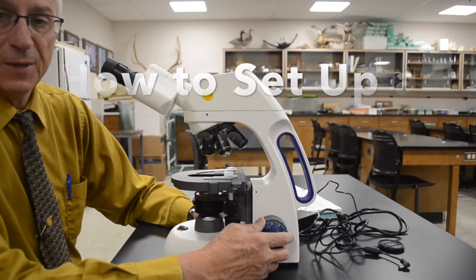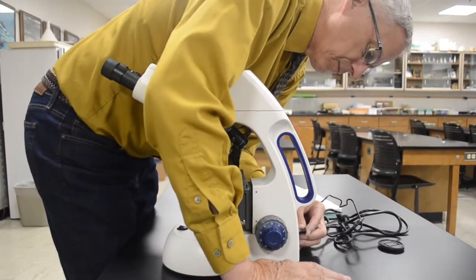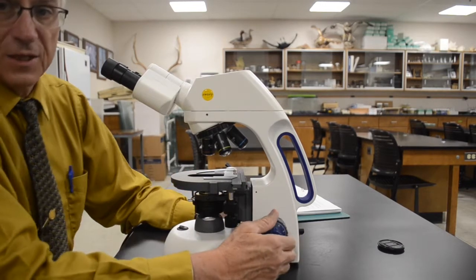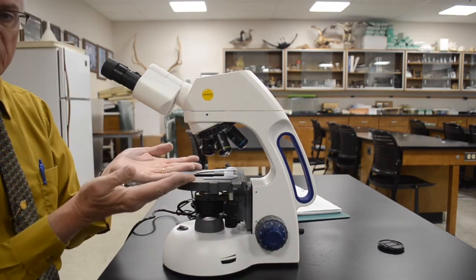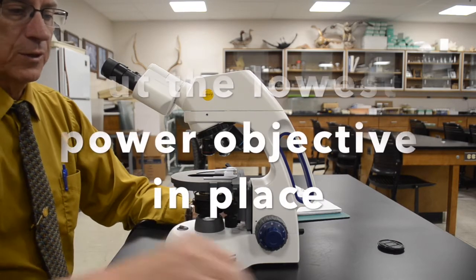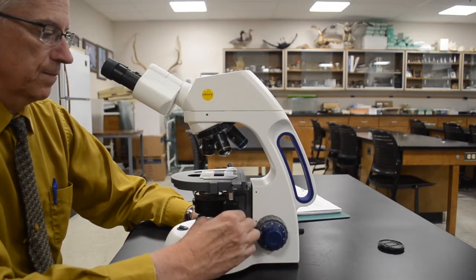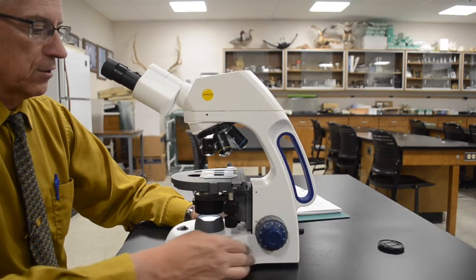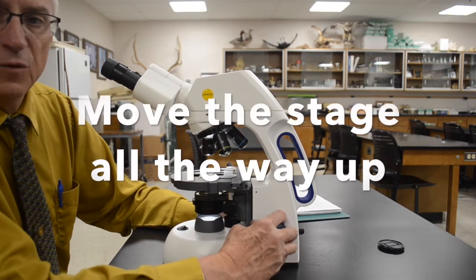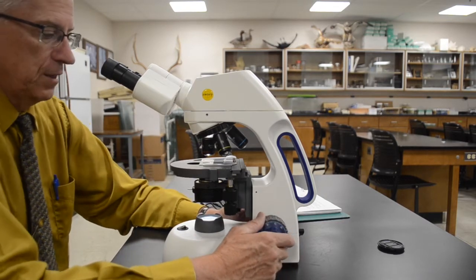The next thing I want to show you is preparing a microscope for use. Attach your power cord and plug your microscope in. If the person ahead of you knew what they were doing, the slide table should already be in the lowest position and the lowest magnification objective lens should already be in place. Take a microscope slide with something on it that's relatively easy to find, turn the light on, and move your slide into the center of the illumination. Then rotate your slide table all the way to the top.